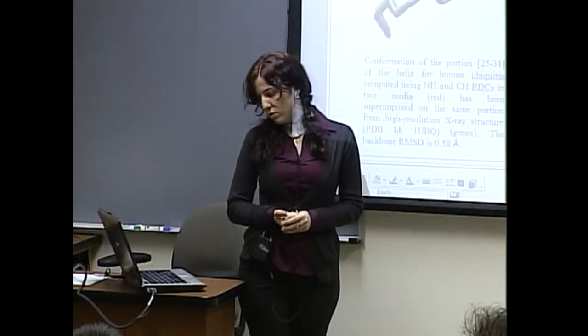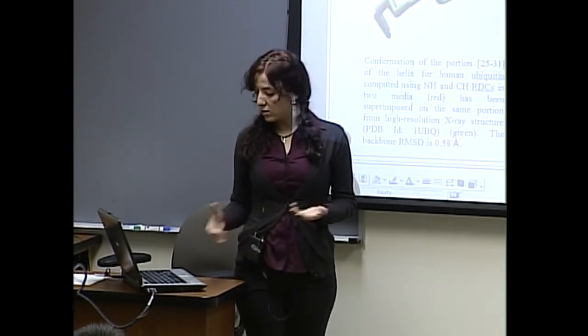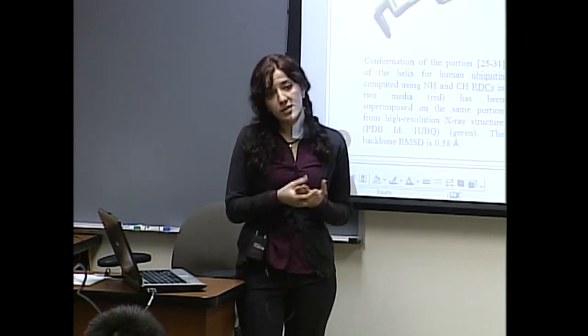Biochemists. Well, what we do, there are many structures which are known, so you can run your algorithm to see whether it will be reliable, and that's what we did. Against something known, yeah. And then what our lab did, they obtained new data for a new protein, and they ran the algorithm. The algorithm returned a very good fit to the experimental data. So how do you know? We deposited it because it seems biologically valid. There are no steric clashes. You can also evaluate the protein structure using standard biological tools. There are a lot of software programs which can tell you whether there are steric clashes or whether the energies are good. So yes, you run against that as well, and then there is nothing else you can do.